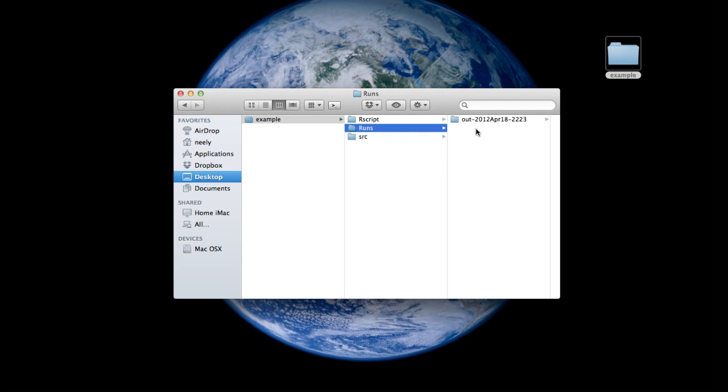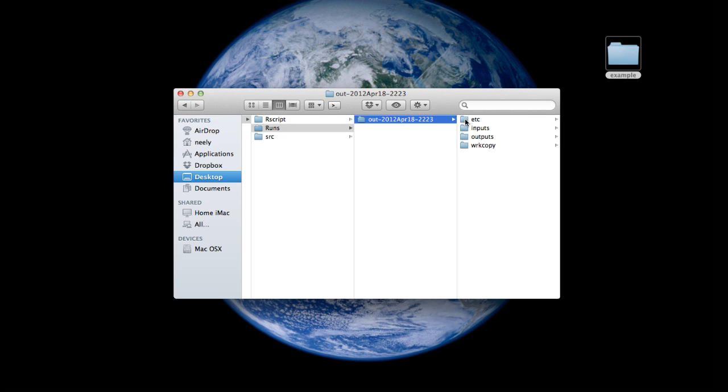Now you can see that I already have an output directory from the previous run here. I'm going to go to that directory and you'll see that there are four further subdirectories: etc., inputs, outputs, and working copy.